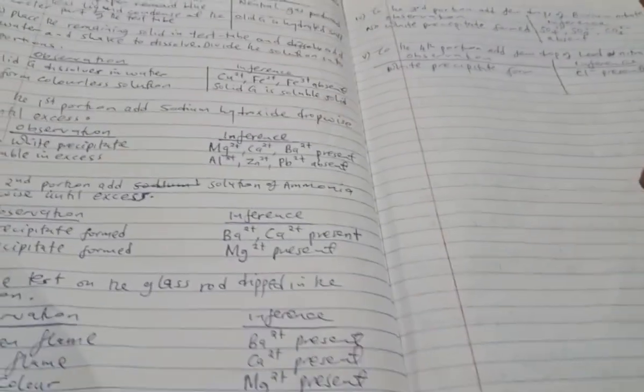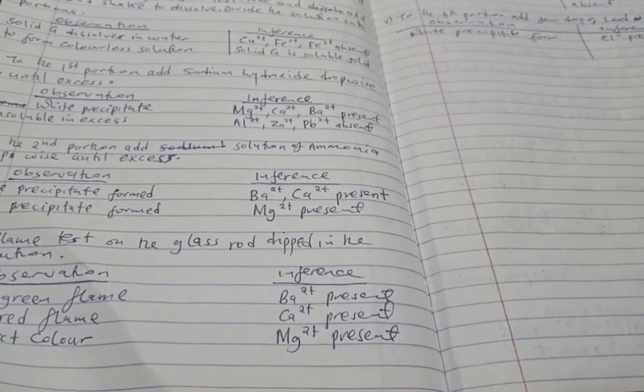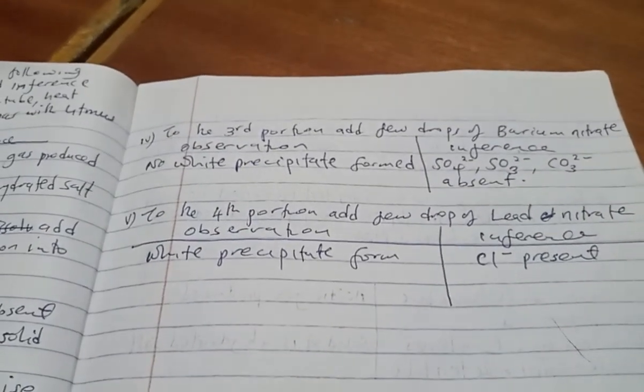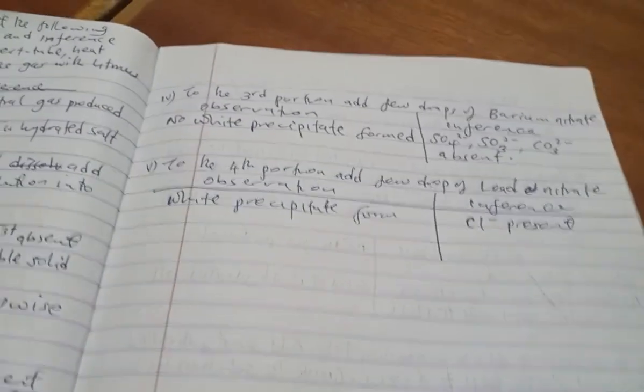Good. Now we have tested for cation. We need now to test for anion. Maybe you are given a third portion. You are given barium nitrate. Whatever you are given, you just use it.